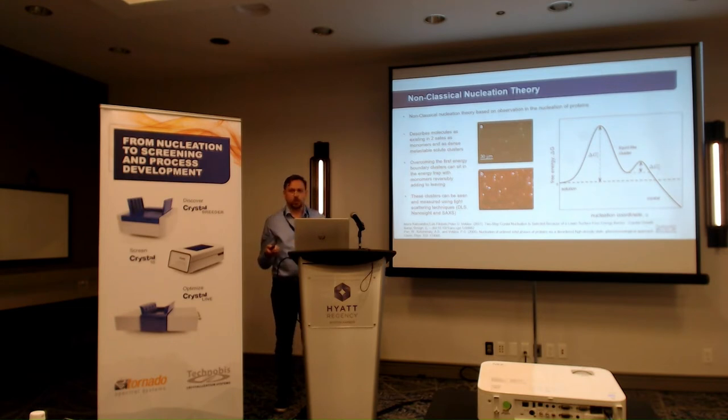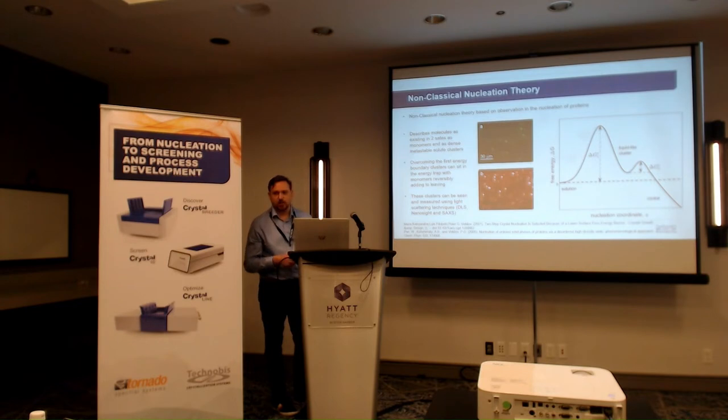It has been shown that even if you then filter these and remove them, the actual nucleation rate decreases within those systems. You can also see these by small angle X-ray scattering. There have been several papers on this that have shown that.